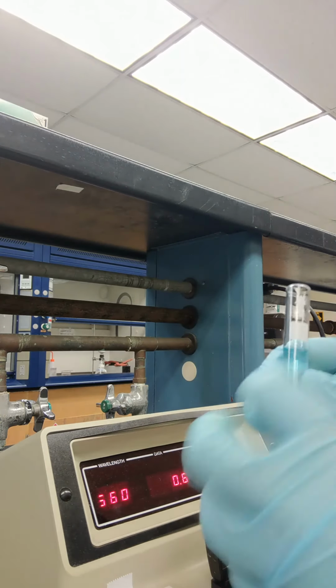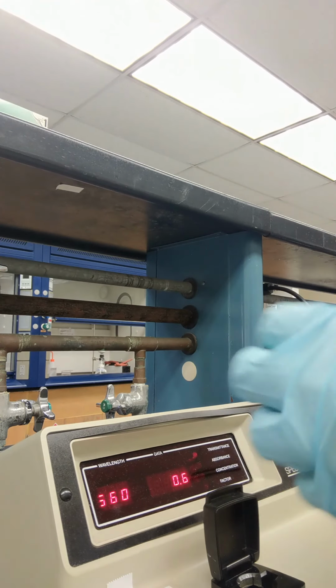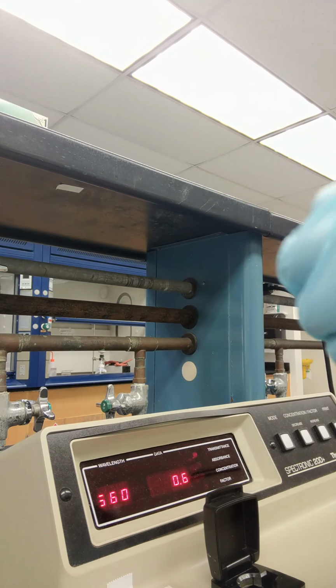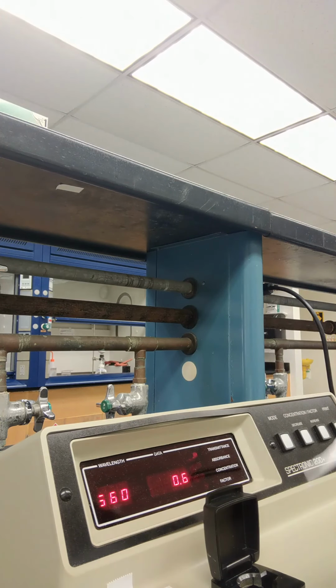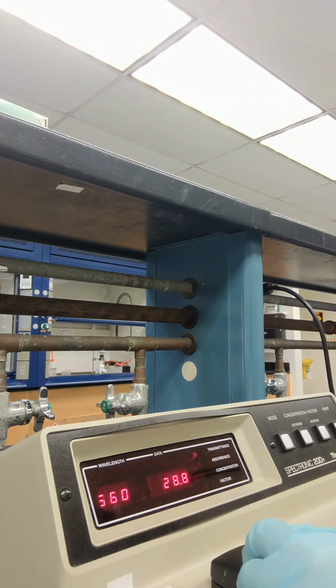We can fill the cuvette all the way to the mark that we have right there. That should be enough. Clean the cuvette using a Kimwipe to remove any fingerprints. Placing it here, closing, and we actually need this set to absorbance.